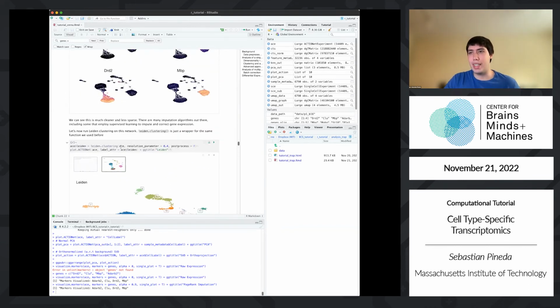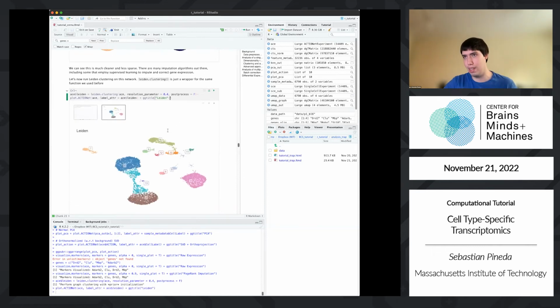And now we can take that same graph that we built, the new fancy one that uses the Jensen-Shannon distance and all that, and we can put it back into the Leiden clustering algorithm with the same parameters that we originally fed the UMAP KNN graph, and we can get a much better clustering. So now we have, how many clusters do we have here? We have a similar number of them, but now they map better to the clusters that we can see and the clusters that we know actually have distinct identities.